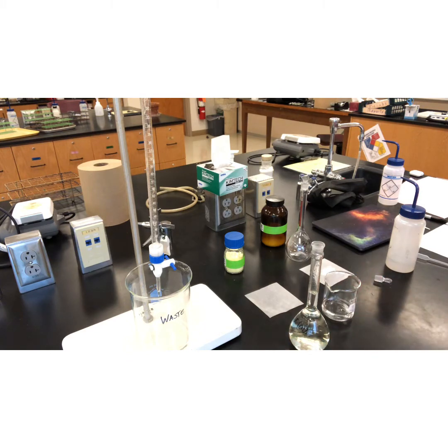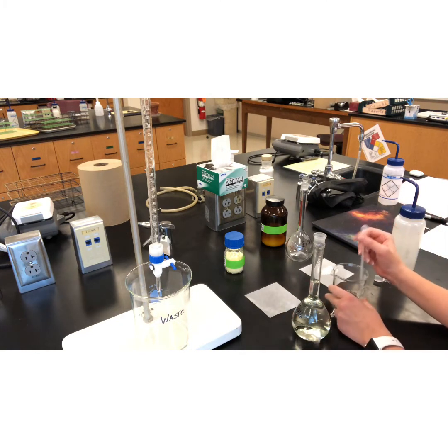Really close to the end, so now I'm going to get a pipette and I'm going to squirt water in dropwise at the end because I do not want to go past that and start over. That does not sound like fun for me this evening.